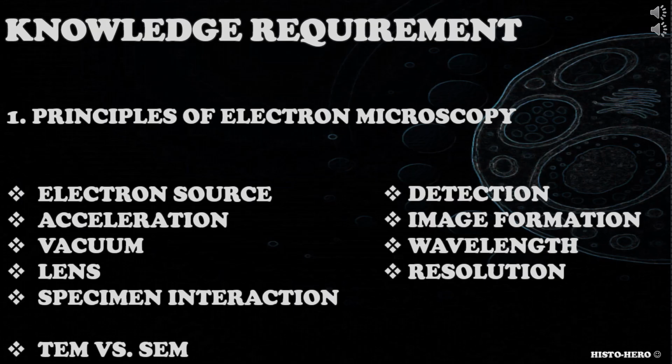The first knowledge requirement is principles of electron microscopy. Candidate needs to have the knowledge and understanding about electron microscopy. You could ask the candidate to explain what is electron microscopy and how it works, to name the key principles of electron microscopy, to differentiate between TEM and SEM.